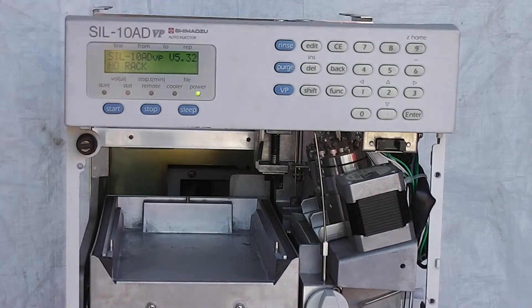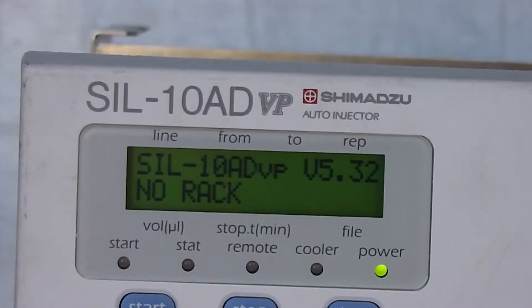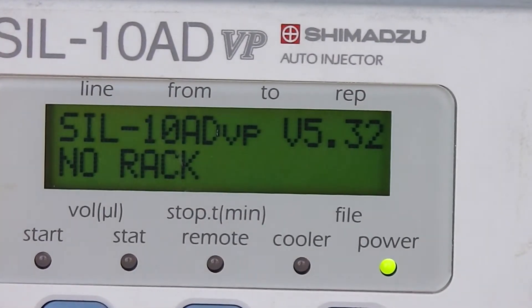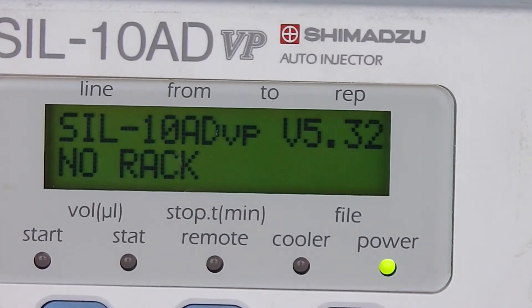Now we get a different message here, a no rack message, and I'll put that in the auction sold non-working for parts or repair.